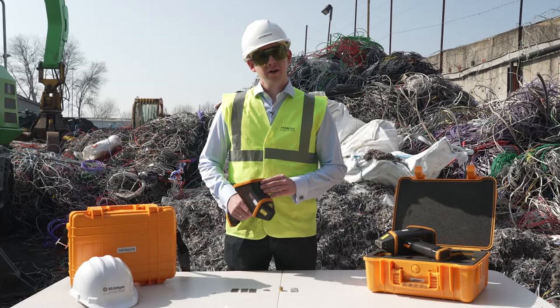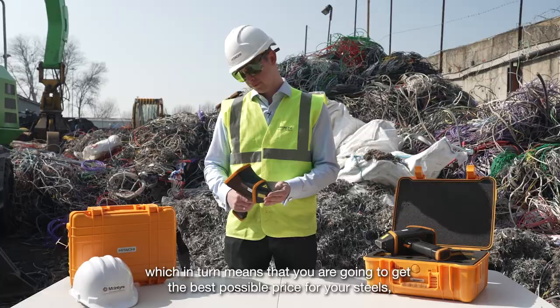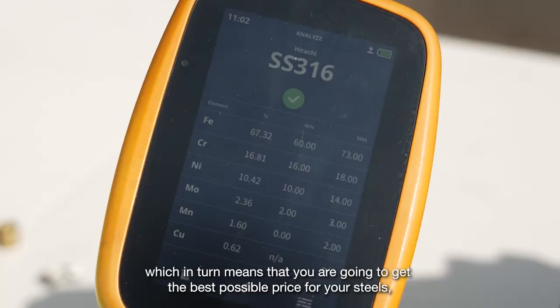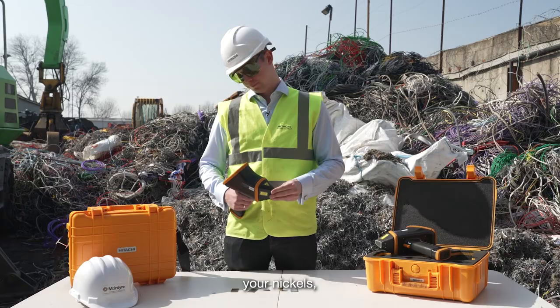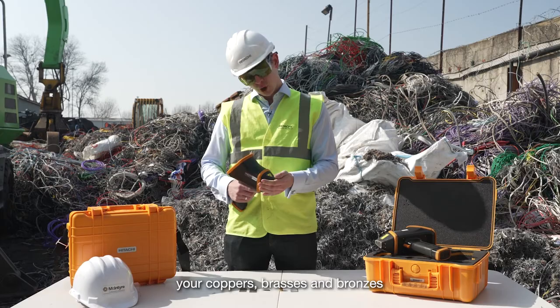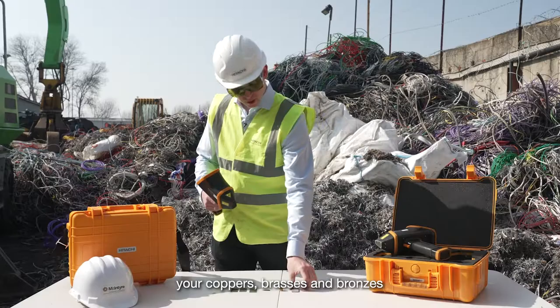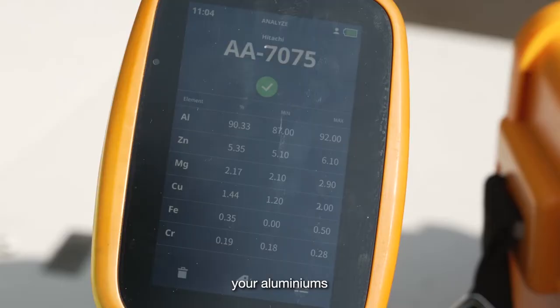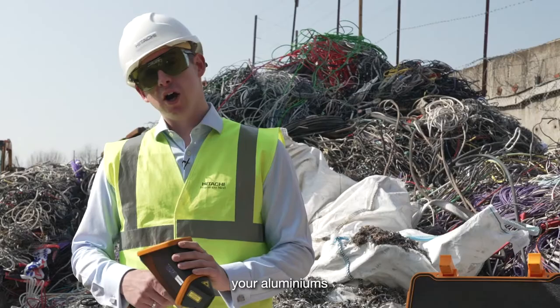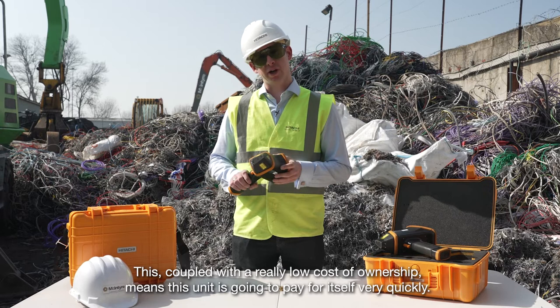Faster analysis means that you can measure more samples in a shorter space of time, which in turn means that you're going to get the best possible price for your steels, your nickels, your coppers, brasses and bronzes, your aluminiums, as well as your carbon steels, your speciality steels or titaniums. This, coupled with a really low cost of ownership, means that this unit is going to pay for itself very quickly.